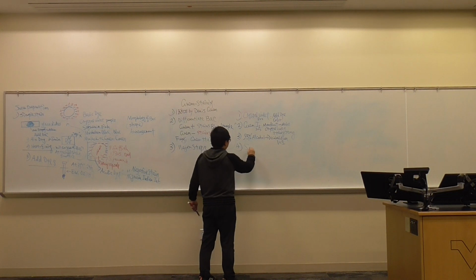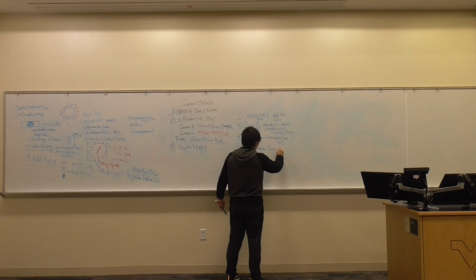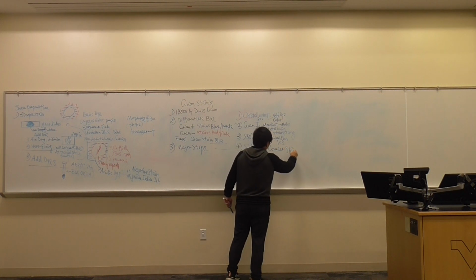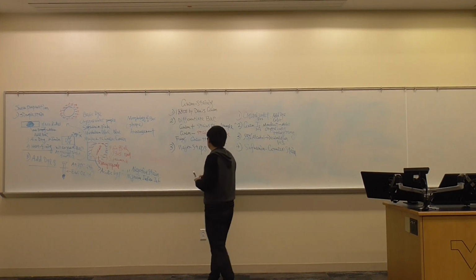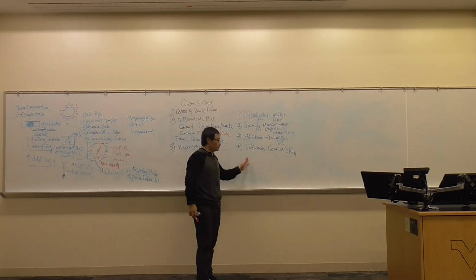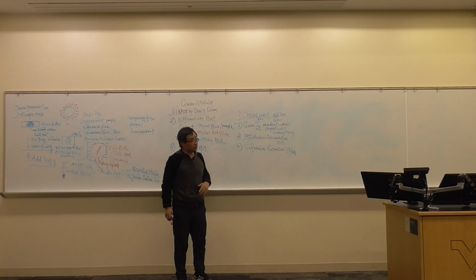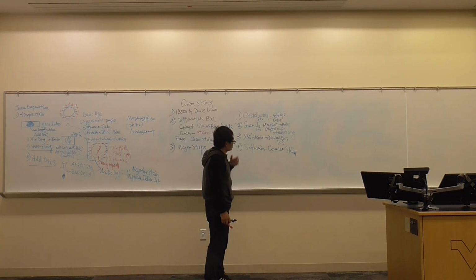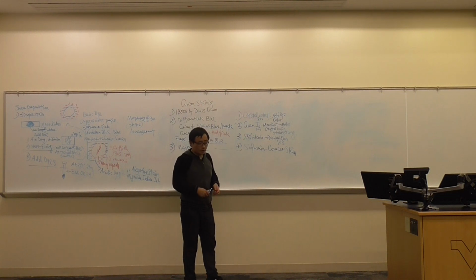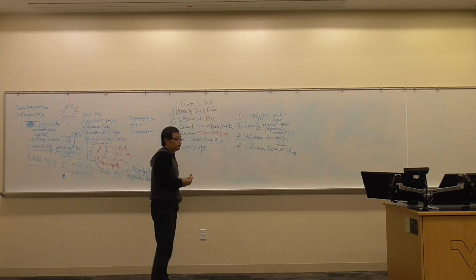Last one, we add safranin. This is also, we call it a counterstain. So this is very important, the procedures. And in the lab section, I always tell them, the procedure is important. If you mess up the procedure, it will not show the ideal results. But the timing is not important. You can just stain 45 seconds, a minute, that's okay. The only critical thing is that the 10 seconds decolorization process is critical.